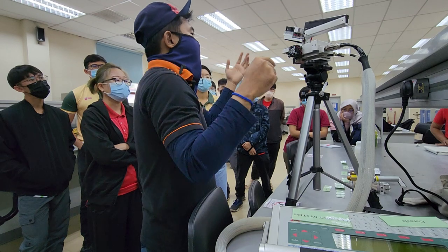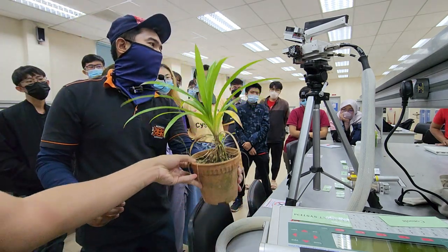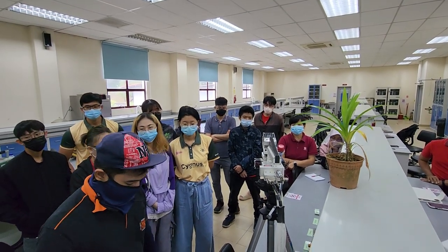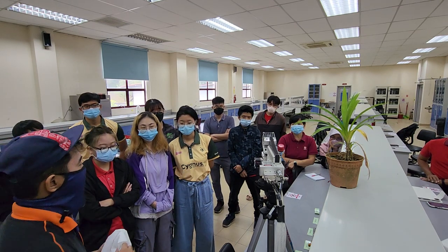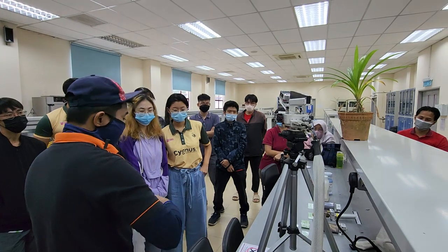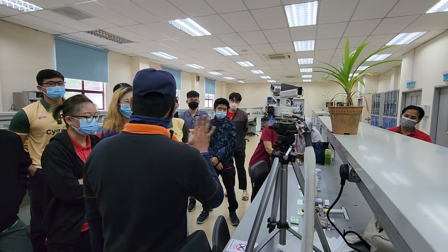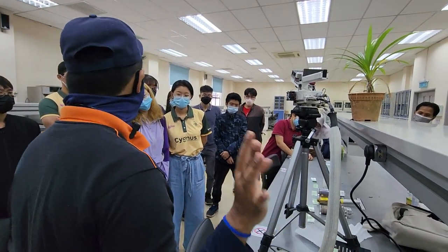Okay, so you will have your plants. Can we get a plant over here? All right, I'll just do it quickly. Remember the other name for this thing? IRGA. Stands for infrared gas analyzer. You see the word gas? Meaning no liquid should be present in this thing, because if liquid is present, it's going to get sucked in and destroy the whole machine.